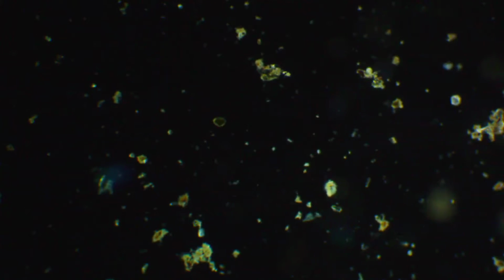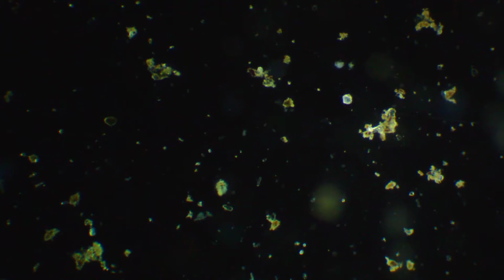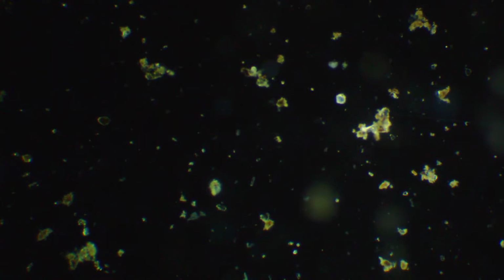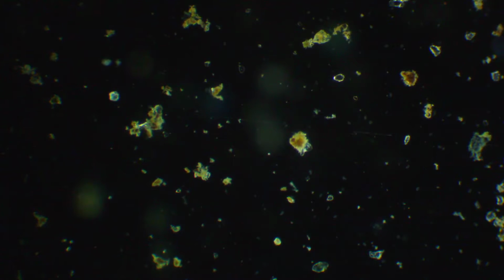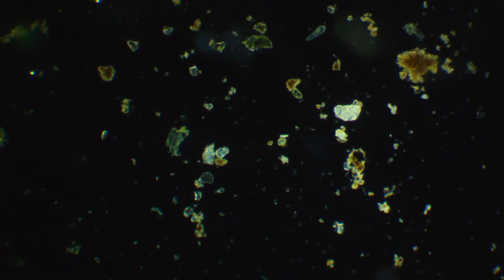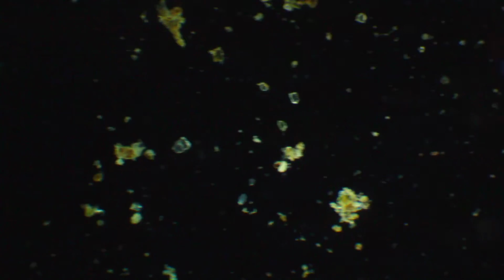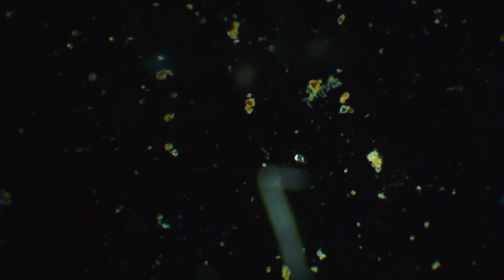So, you know, I haven't found anything new. This was also the sample that I found the one rotifer in, but I haven't found anything new. Oh, there's another little worm with some moss in his tummy. Another worm there, chewing on some moss.